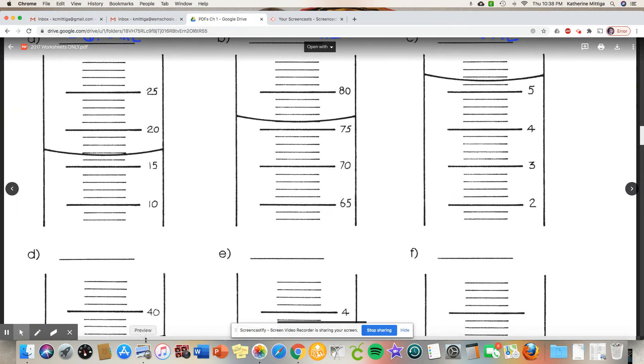Looks like each of these is worth one milliliter, so 15, 16, 17, so it's definitely 16 but we have to estimate. Now read from the bottom of the curvature, I'm gonna go with point eight. You want to say point nine? Fine, do it.